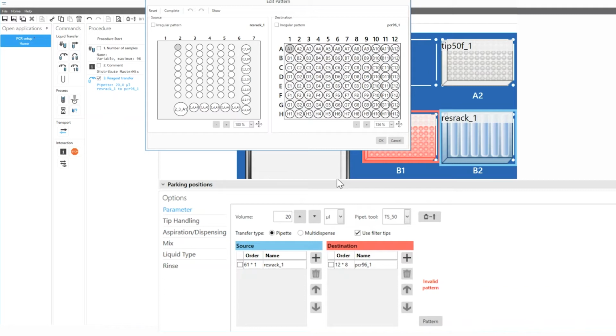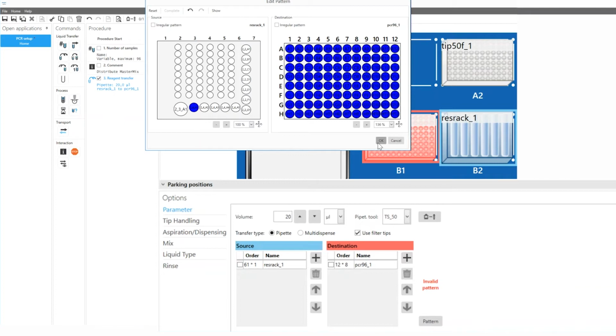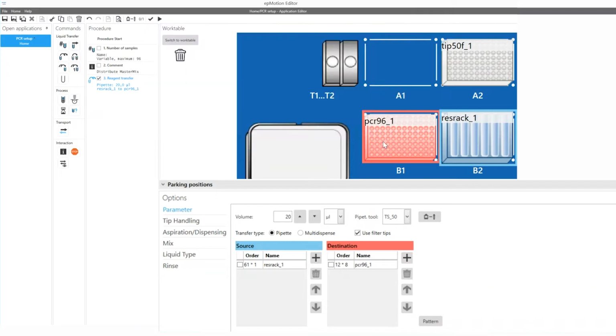Finally, you need to define the pipetting pattern, but don't worry, this can be done with just 2 clicks. Simply define the vessel that contains your PCR master mix and press complete. The pattern of the destination labware is automatically added by the software.